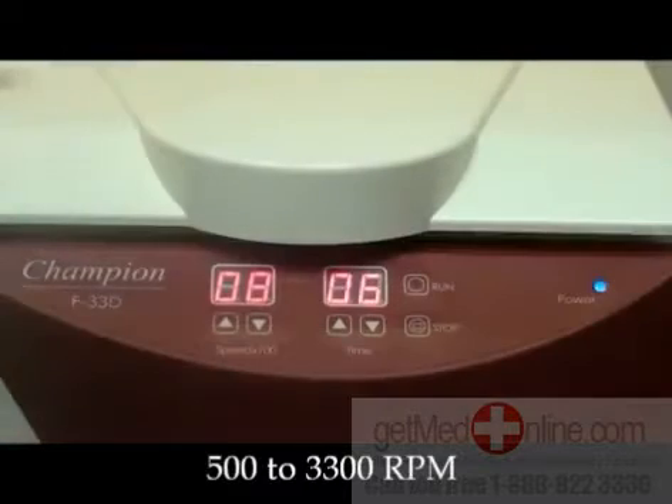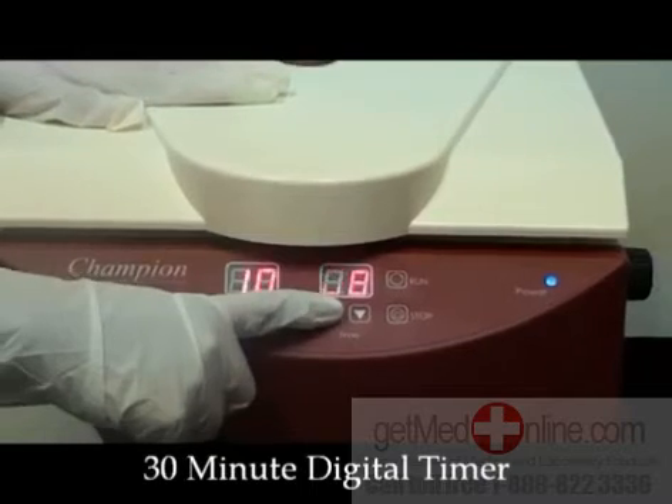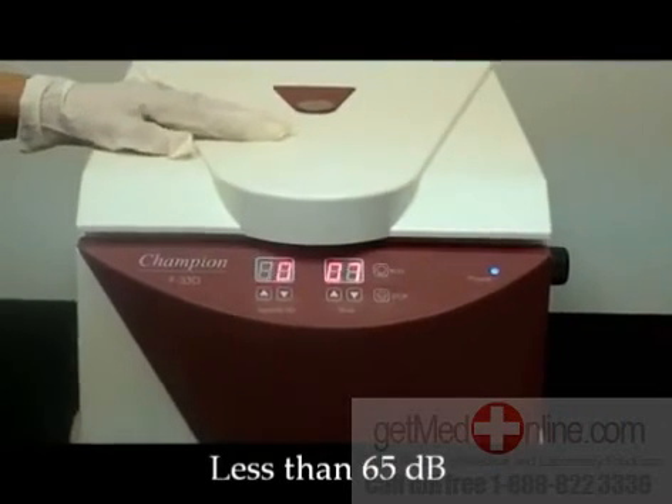It runs between 500 and 3300 RPM with a digital 30-minute timer, and it operates at less than 65 decibels.